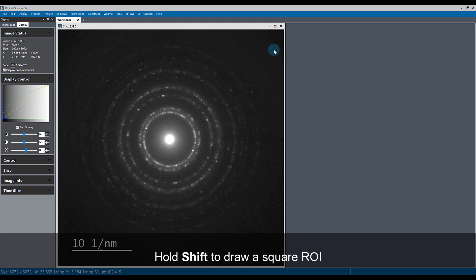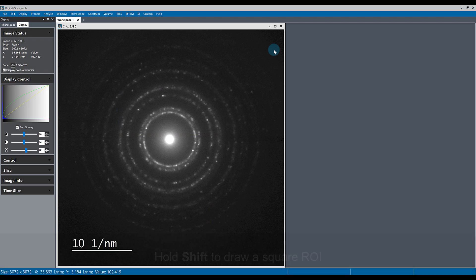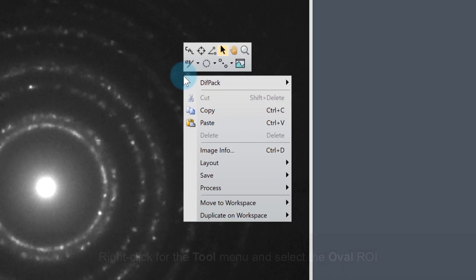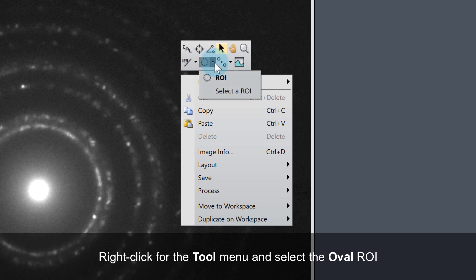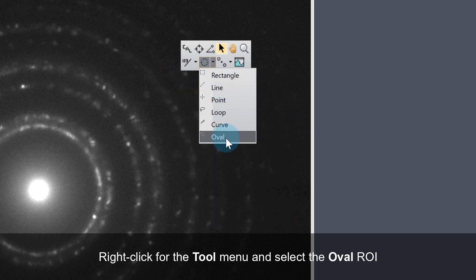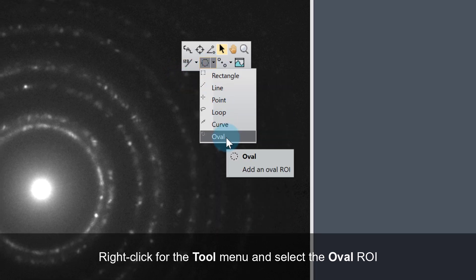If you're working with an image like a diffraction pattern where you want to draw a perfect circle region of interest or ROI, you can again access the ROI tool by right-clicking on the image and selecting the oval tool under the ROI menu.